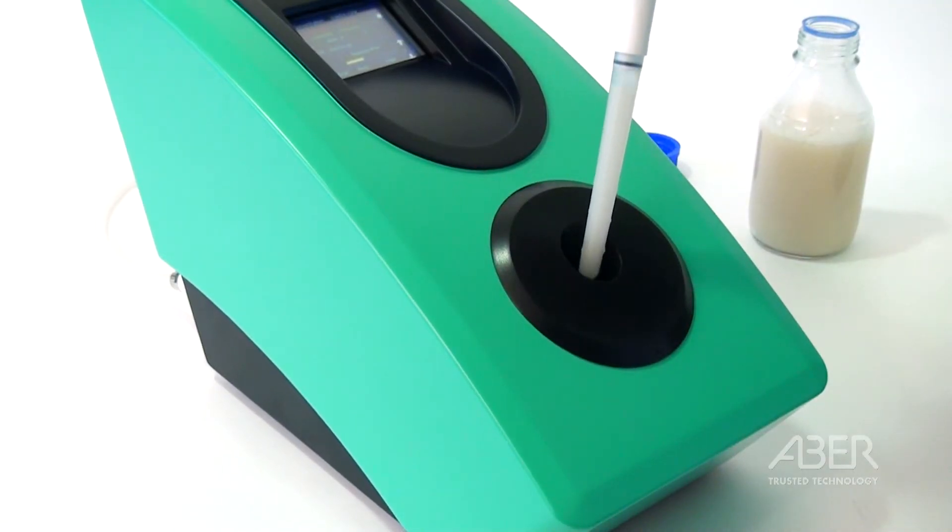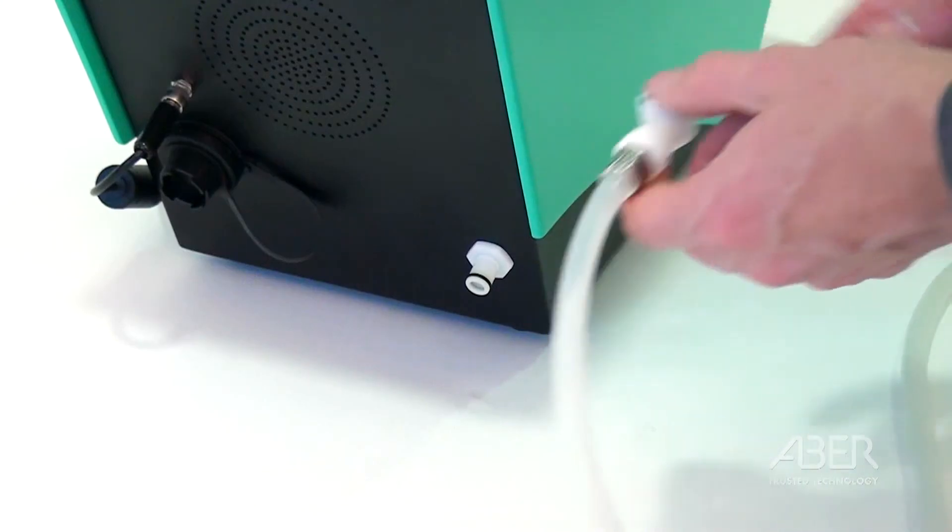No expensive cassettes, replacement slides, or potentially carcinogenic dyes are required. Once calibrated, it's plug-and-play.